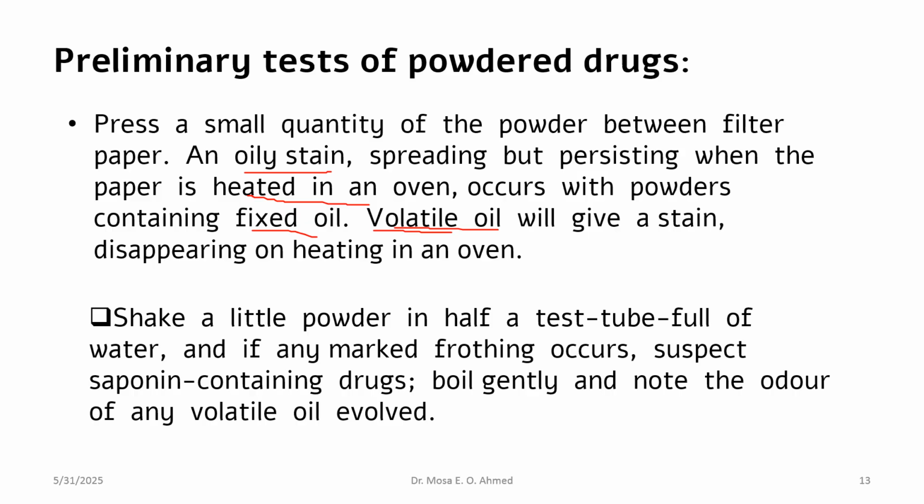Regarding the presence of fixed oil and volatile oil, we press the powder between two filter papers and note the spot. If it is resistant on heating, it is fixed oil. And if it disappears or evaporates, that means it is volatile oil.